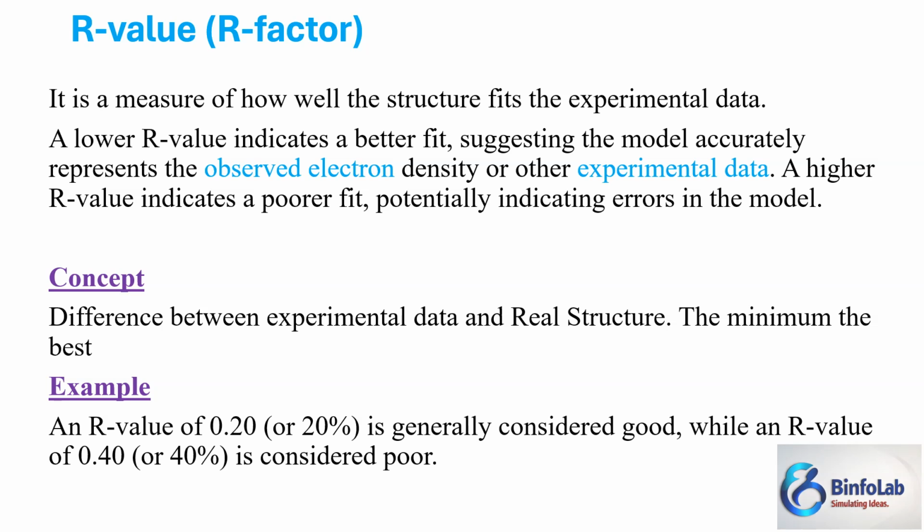For example, if the spots on the electron density maps show something else, but due to some reason the crystallographer managed to derive a structure from that data, then the computational program matches the difference between that experimental data and the structure.